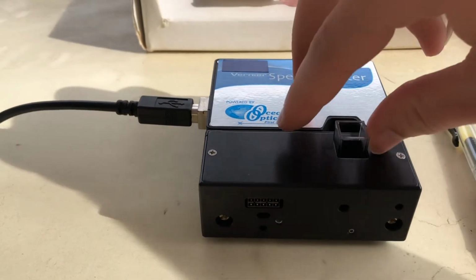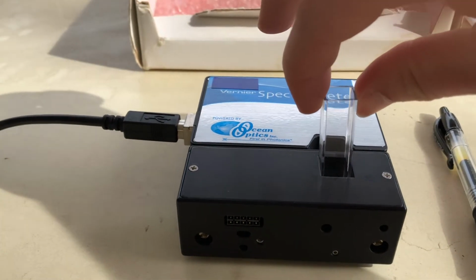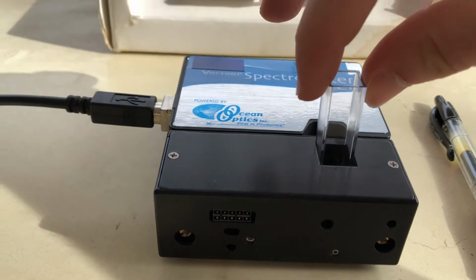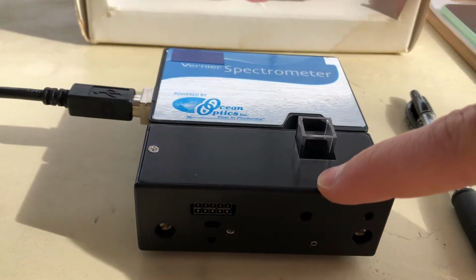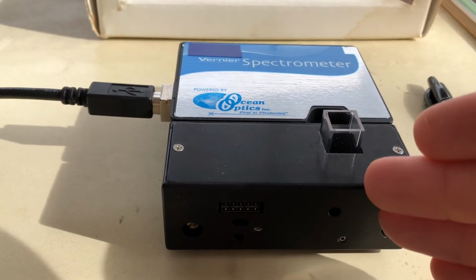Now, if I had something like a really, really dark liquid, like maybe prune juice or something, that would probably absorb quite a bit of light. Now, obviously, it would absorb different amounts of light at different wavelengths, but when the light goes through the sample, it's picked up by the receiver, and then it sends a signal to the computer saying how much of the light was absorbed by the sample and how much of the light went through the sample.